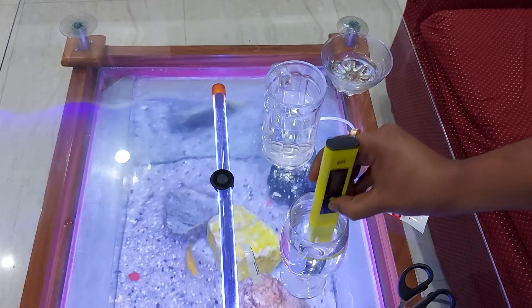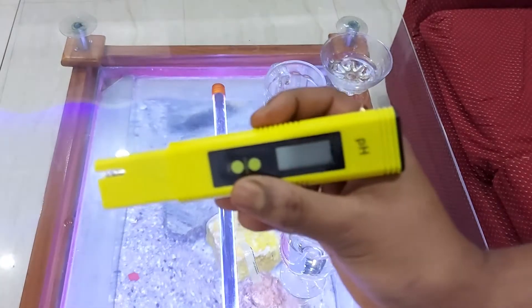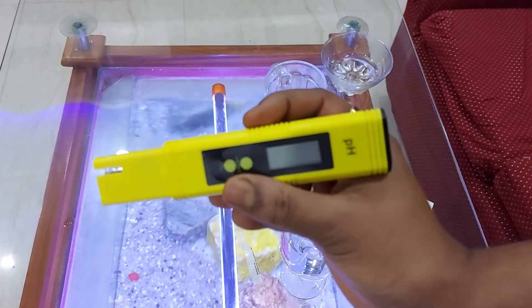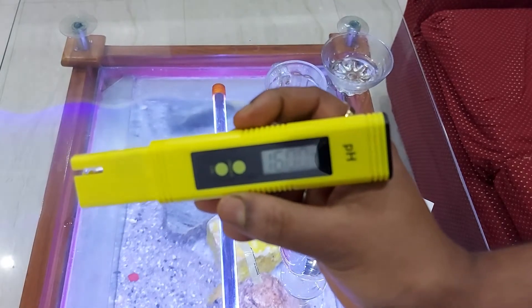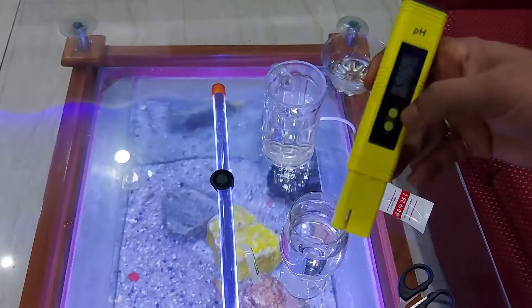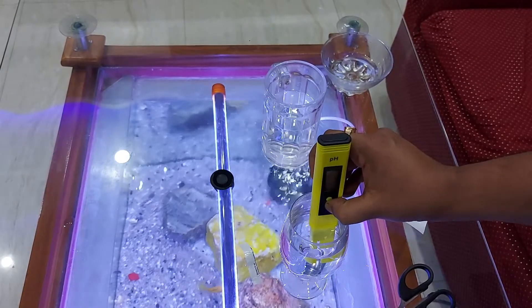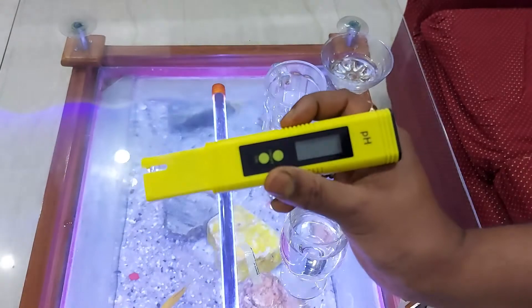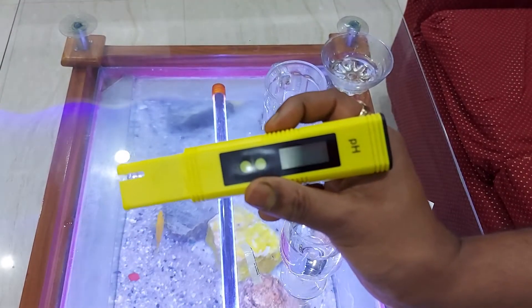Now it's showing 6.86 — the solution was the pH 6.86 buffer solution and the reading is calibrated to 6.86. Let us repeat the procedure: dip it inside and press for five seconds and it will blink 6.86. The first step of the calibration is now done.